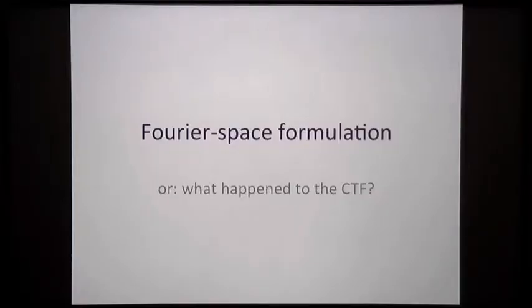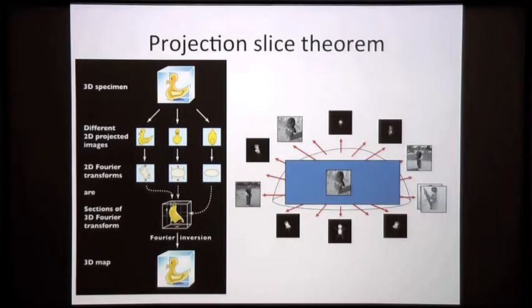Okay? Good. Now, the last part, let's move into Fourier space again. Until now, I've only spoken about pixel values in the images. Now, in lecture 2, we've seen that the Fourier space formulation is much more convenient for a number of reasons: taking projections, slices, etc., but also the effects of CTF, which were a convolution operation in real space, which is very difficult, become just a multiplication in Fourier space, which is much easier. So keep this in mind.